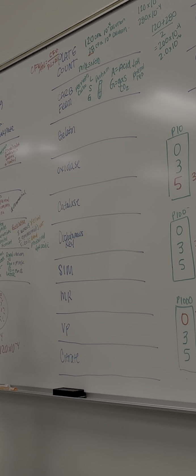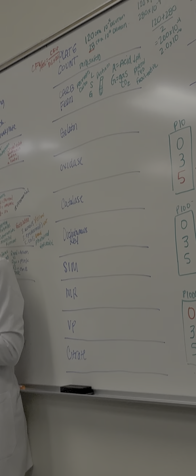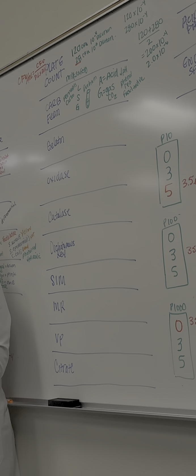All good. Okay, gelatin. What enzyme are we looking for? Let's talk about what the whole point is of gelatin. So remember what it looked like after we let it set and after it went in the fridge? Ours didn't. So what is the enzyme? Gelatinase.